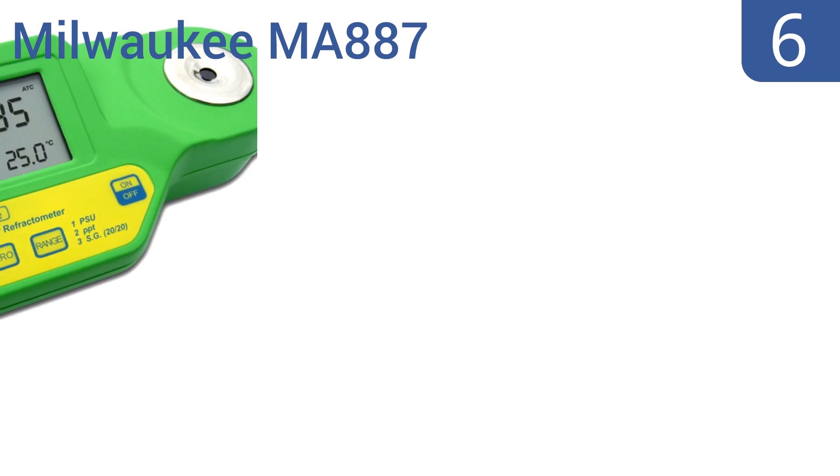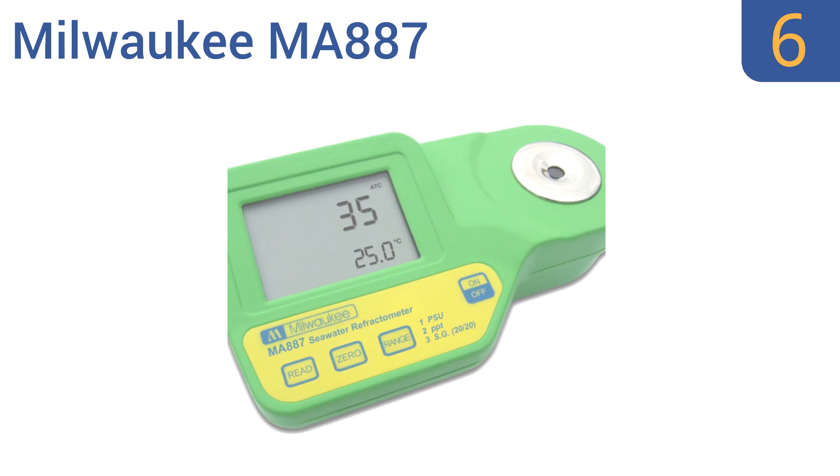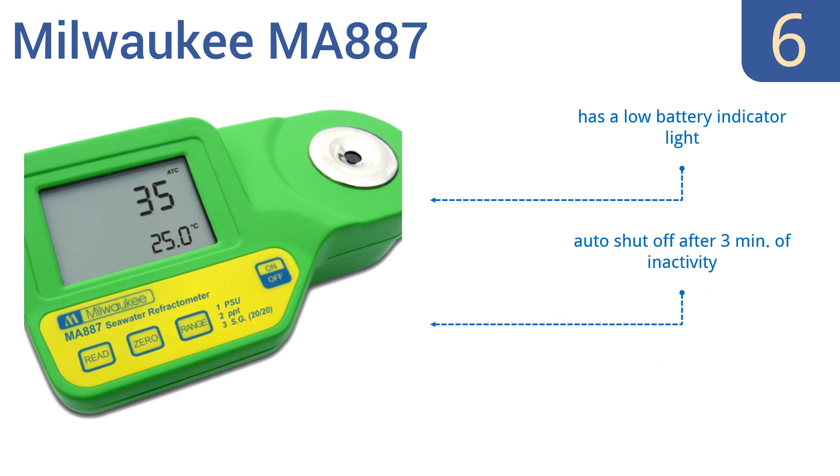Moving up our list at number 6, the Milwaukee MA887 takes the guesswork out of determining the salinity of natural and artificial seawater. It's suitable for ship, shore, or home use, and can be easily wiped clean when you're finished. It comes with a low battery indicator light and automatically shuts off after 3 minutes of inactivity. However, it is hard to calibrate.